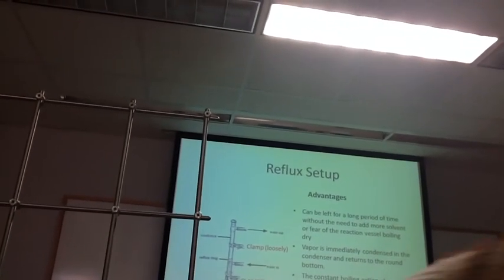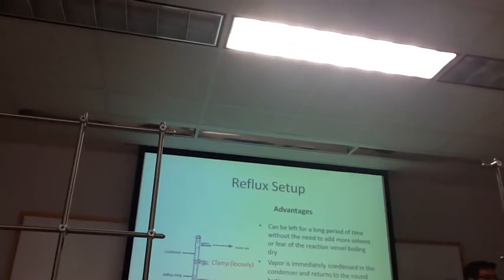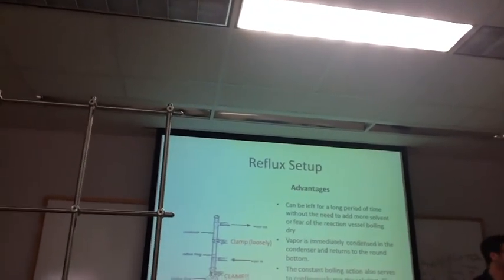There you go. Can you move my keyboard down? Reflux only needs 2 pieces of glass. Thanks. And it's simple installation.